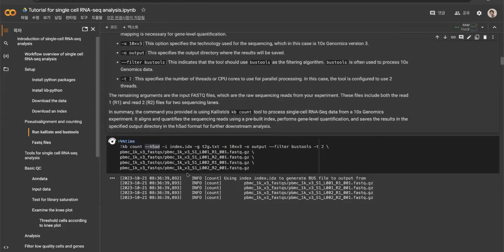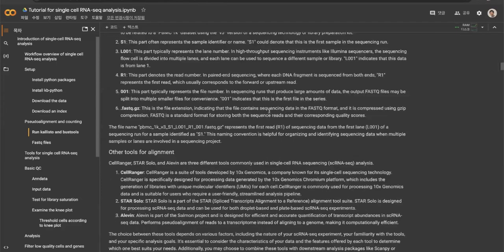So how you can do the sequence alignment. You use this index information. So you get all this FASTQ information mapped into the reference transcriptome, right? So this is the way you get from that process. It takes some time, so we move on to explaining the different parts.